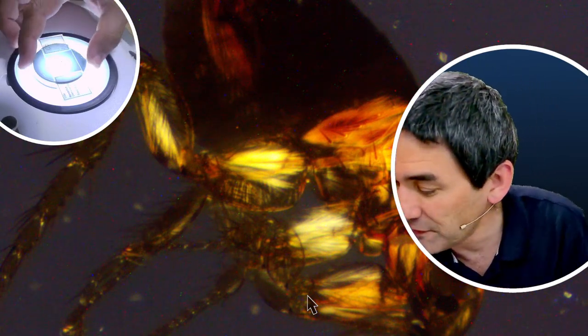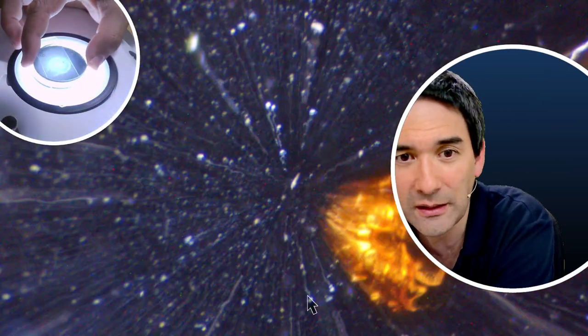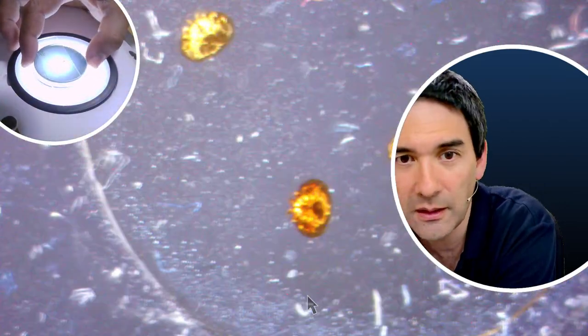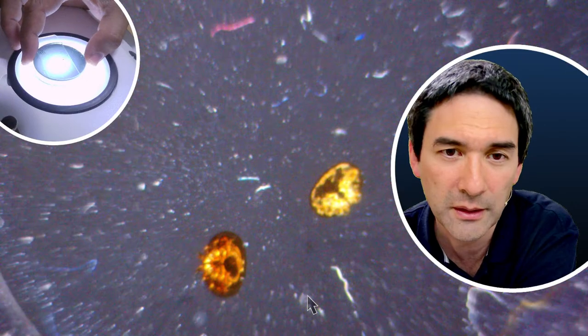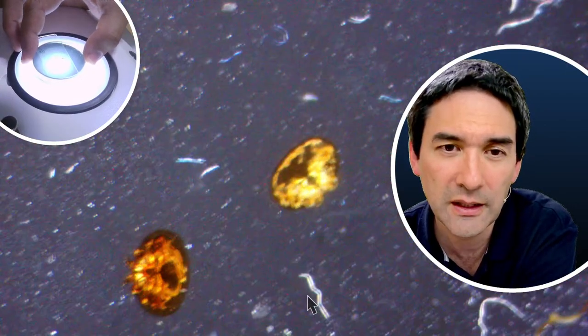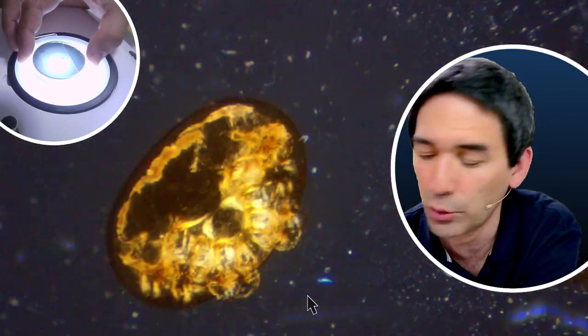So after I've seen the dog flea, I was immediately checking out other specimens as well, and over here I've got some. This one you already know from last week. Always zoom out again a little bit here. That is the varroa mite, a parasite of a bee. It's a little bit disturbing that the camera always readjusts its exposure time.